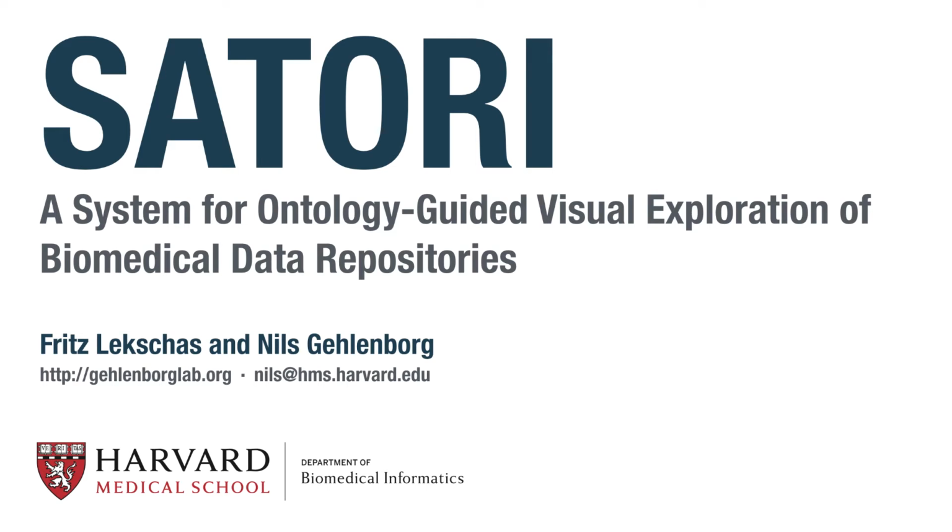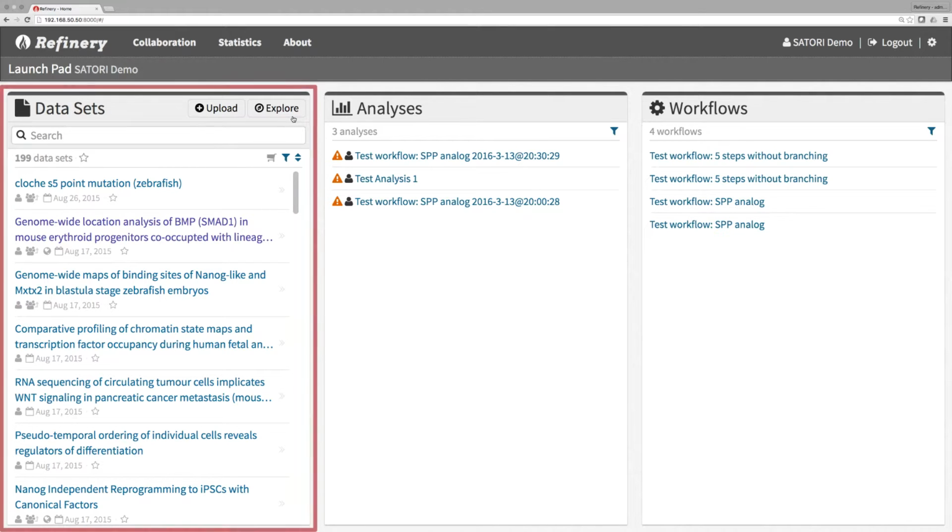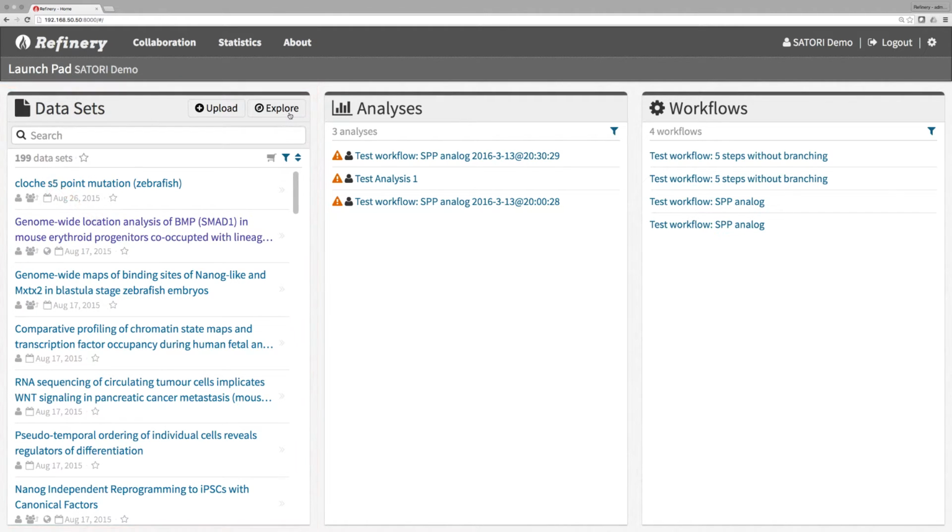Welcome to Satori, a system for ontology-guided visual exploration of biomedical data repositories. In this video, we demonstrate an implementation of Satori in the Refinery platform, a web-based visual analytics platform for managing, analyzing, and visualizing biomedical datasets. For this demo, we have imported the Stem Cell Commons, a collection of 199 datasets from studies related to the genomics and epigenomics of stem cells.